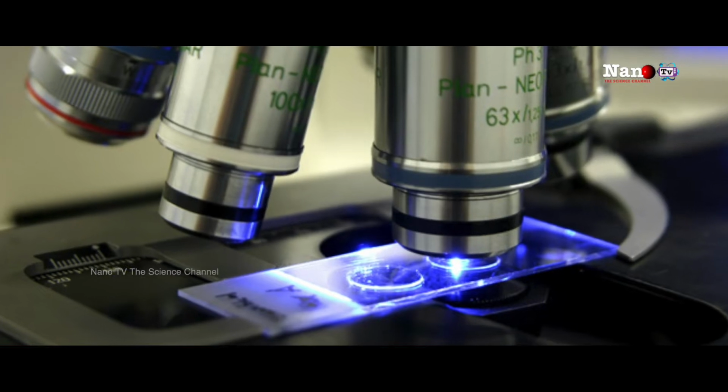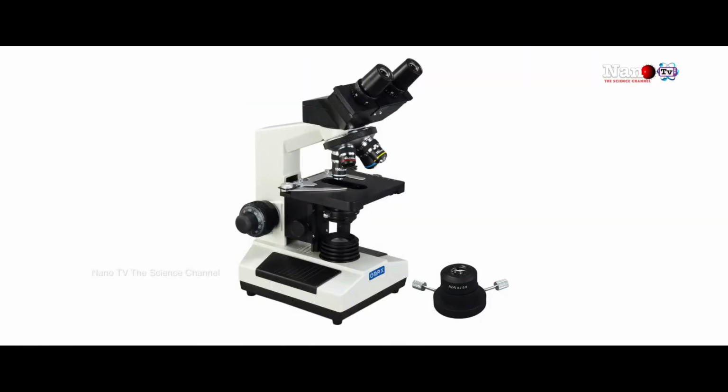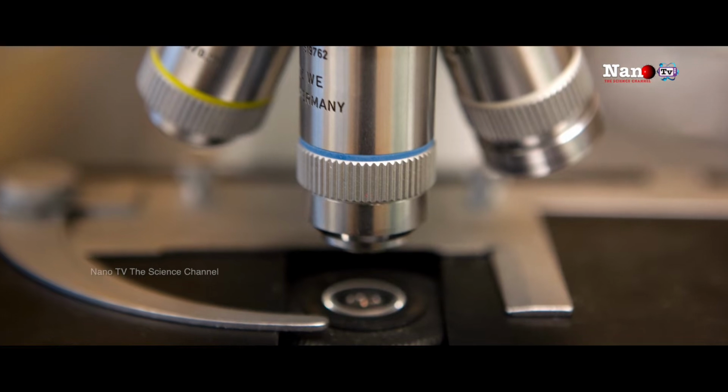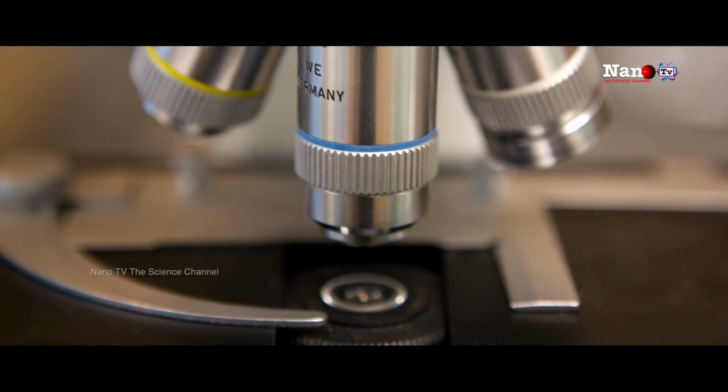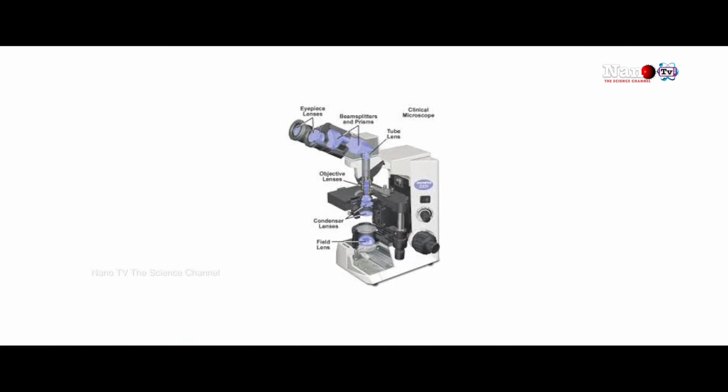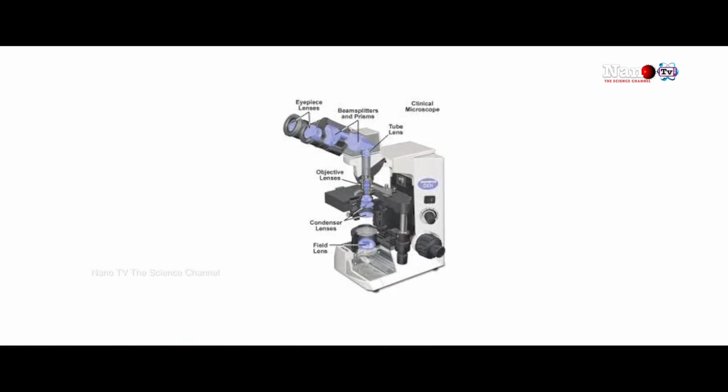The next part is the lens system. There are two types of lens system. One is called the objective and the other is called the condenser. The objective is the lower region, near the specimen. The top region where the electrons start is the condensing lenses. These condensing lenses and objective lenses are mainly to converge and diverge the electron beam.